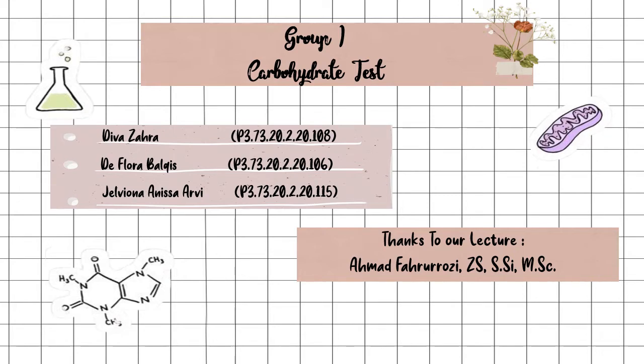In this chance, we will present our results of an experiment about the carbohydrate test.